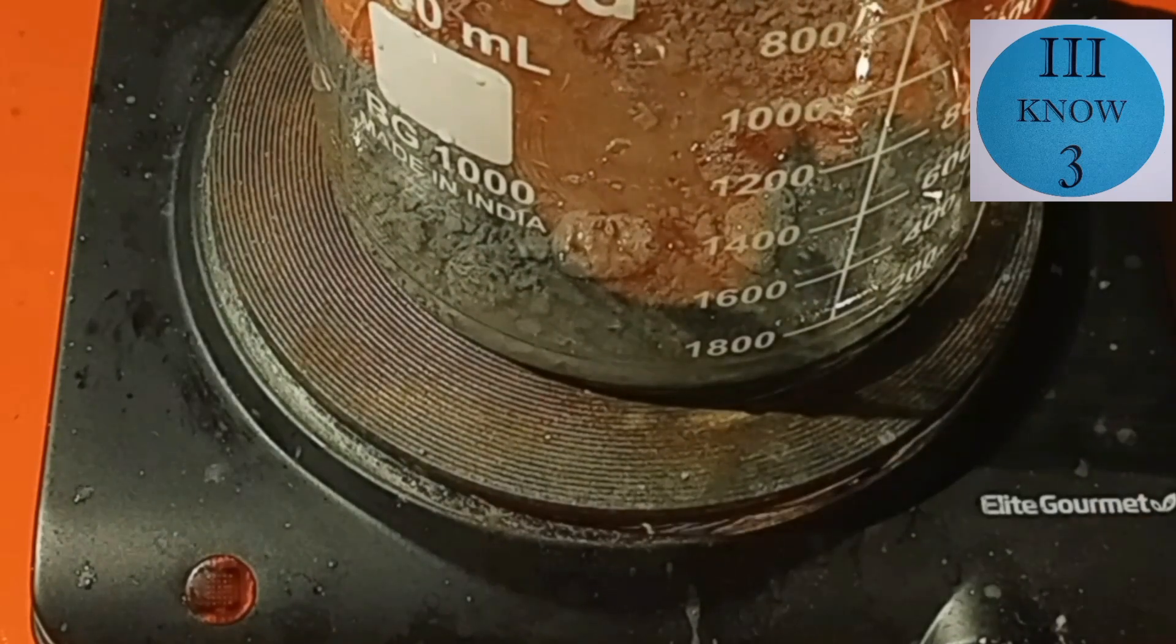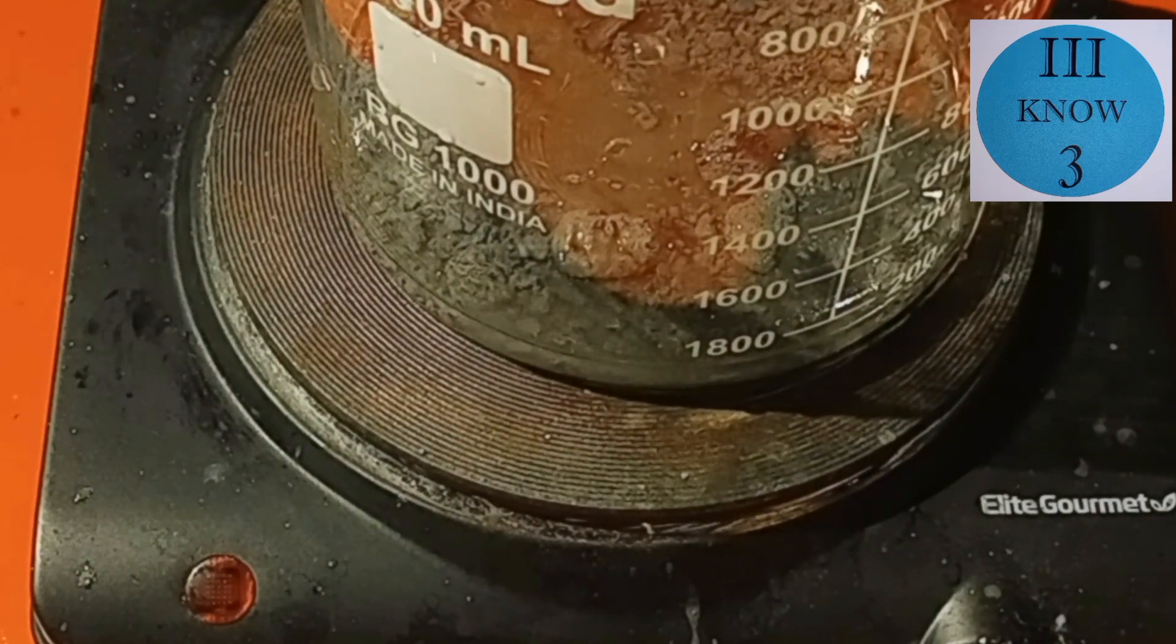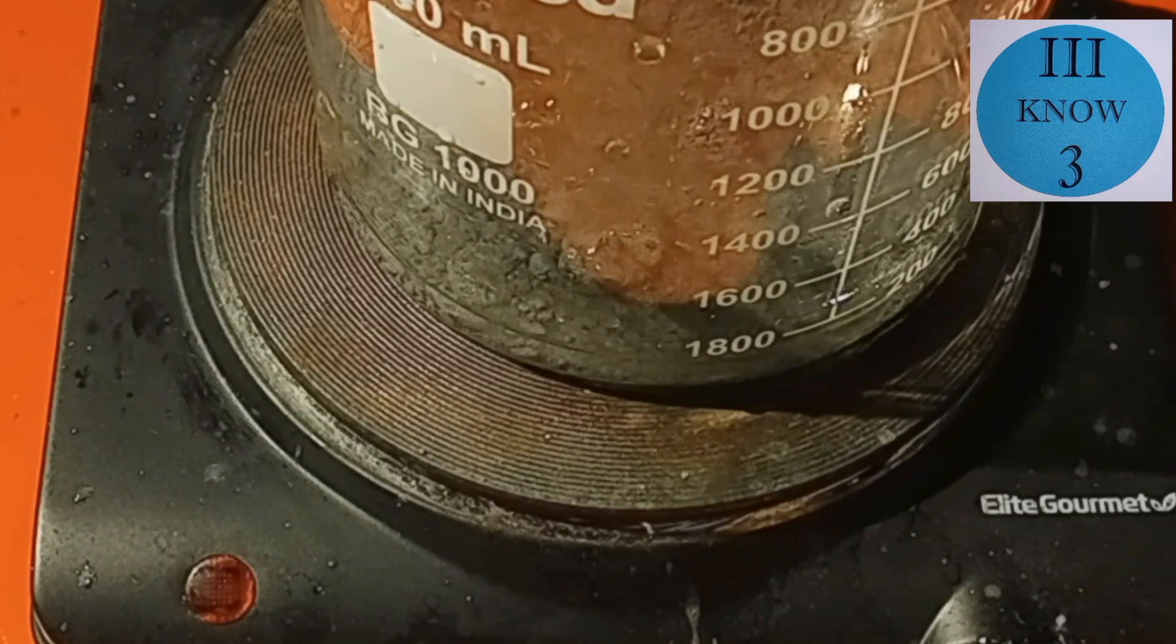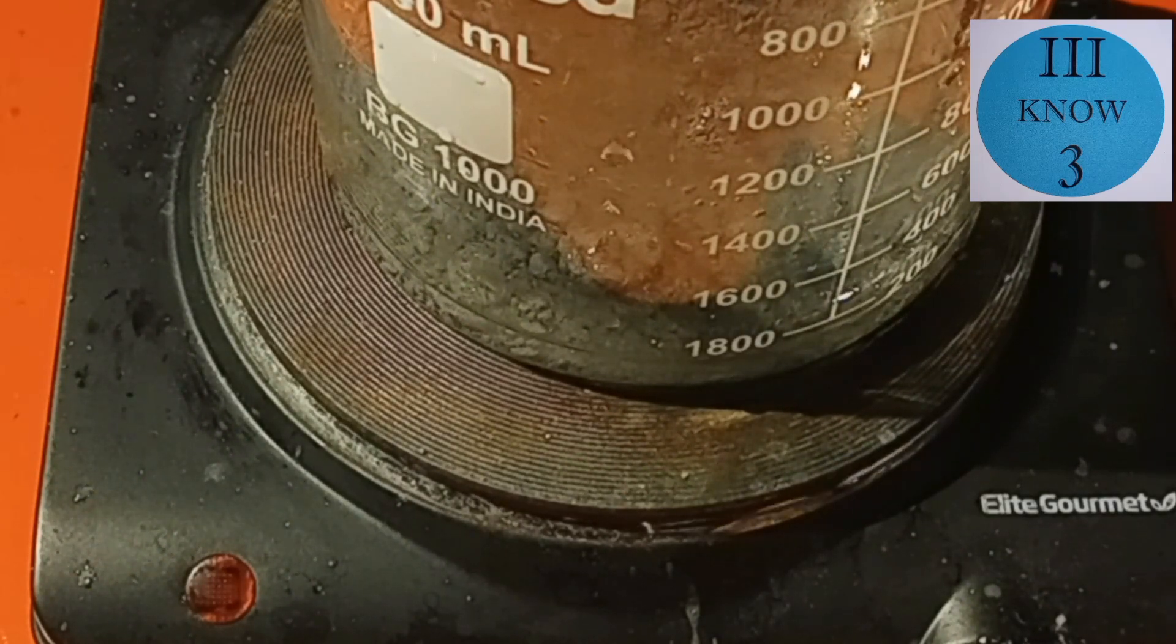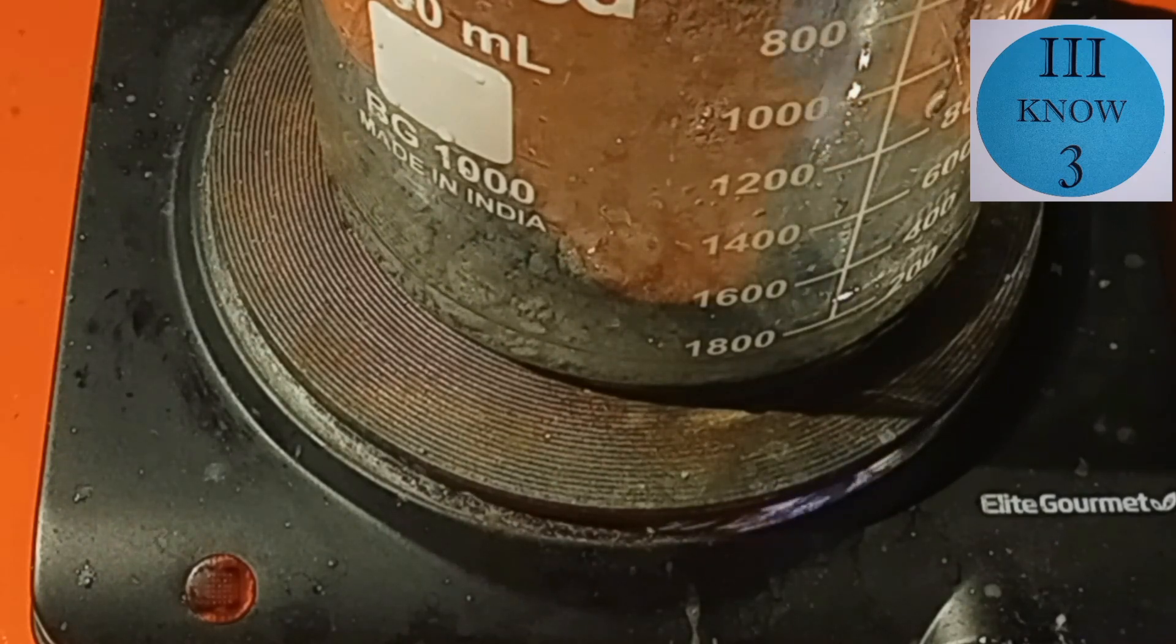And then we're going to add about 100 milliliters of this trans-chem muriatic acid, which is also hydrochloric acid. If you want to know more about the acids I'm using, you can watch my hydrochloric acid versus muriatic acid video.